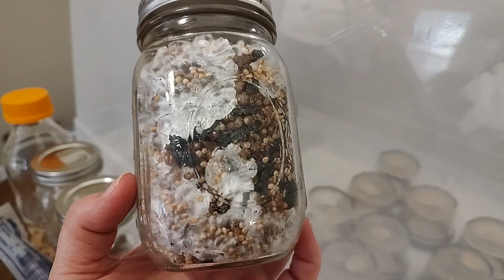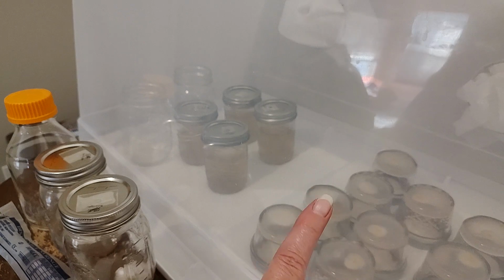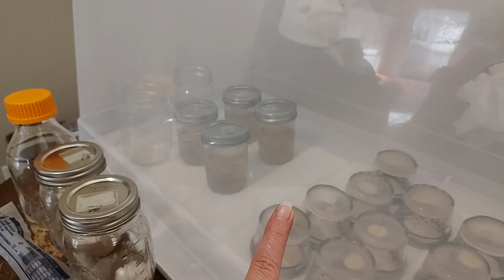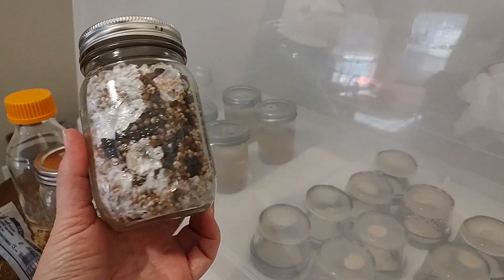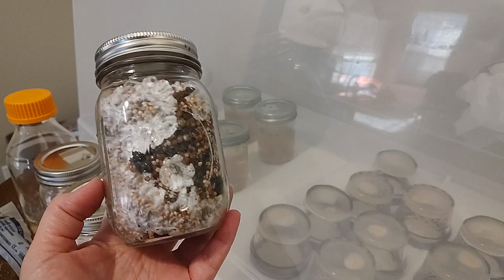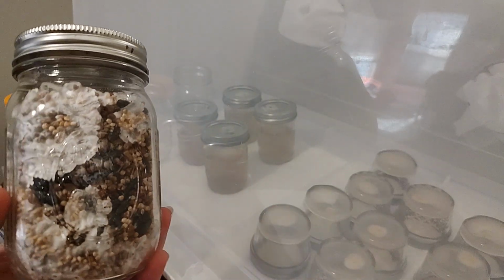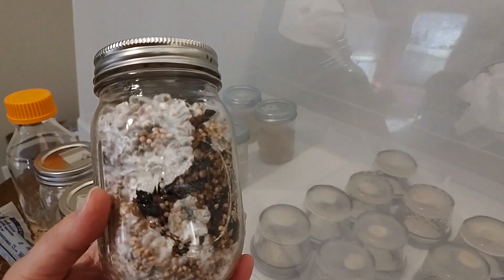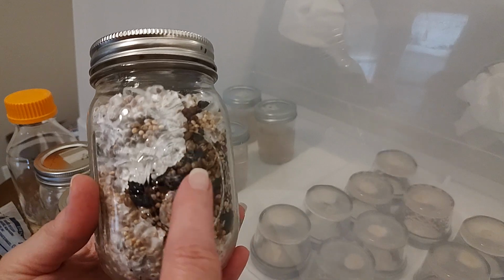And that way you give your spores the opportunity to grow out on the agar plates. And then you can transfer those, eliminating contamination. Every time you do a transfer to a new plate, you're eliminating contamination. And then once you have these plates that have a rhizomorphic growth, again, antlers, the branches, very white and thick, you can put those to your grain.